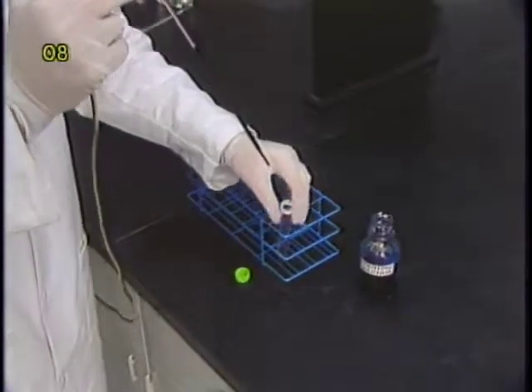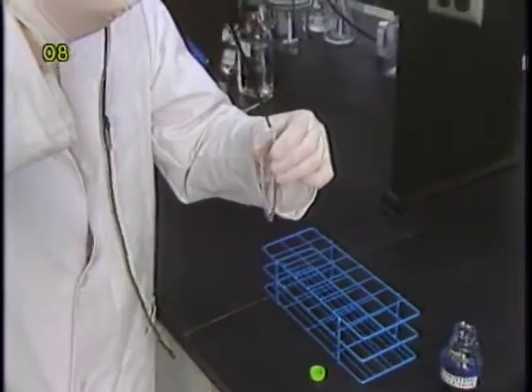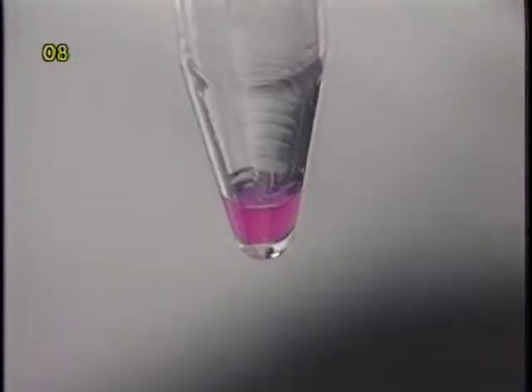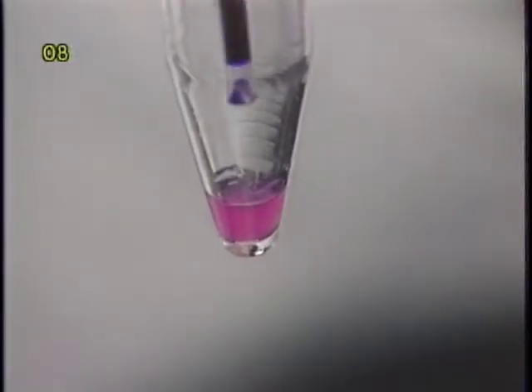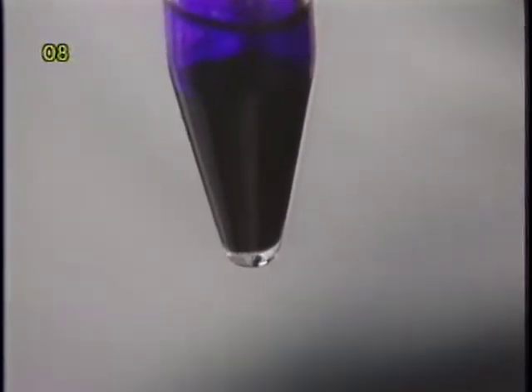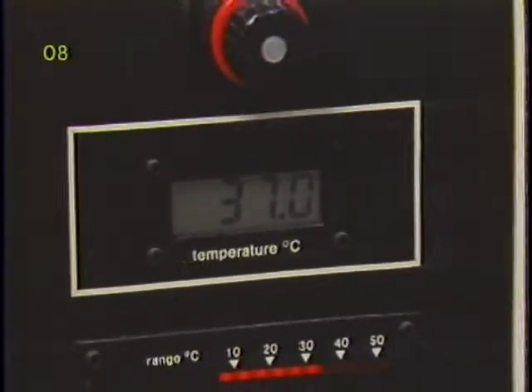Counting solution is then added to the beads to disperse them from the bottom of the tube. Be careful to avoid leaving beads on the wall of the test tube unsubmerged. The test tube is then screw capped and incubated at 37 degrees Celsius for approximately one hour.